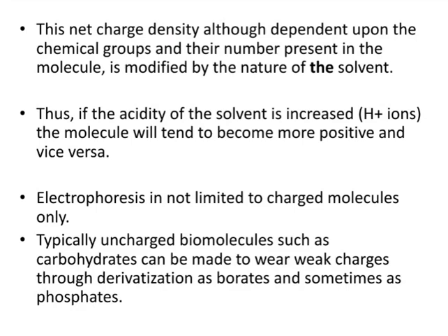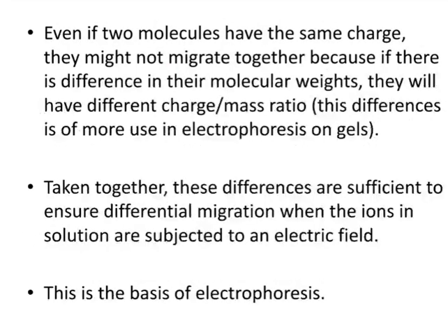So we can say that if we dissolve uncharged molecules like carbohydrates into the buffer, then carbohydrates may wear some weak charges. Now, even if two molecules have the same charge, they might not migrate together, because if there is a difference in their molecular weight, they will have different charge to mass ratios.